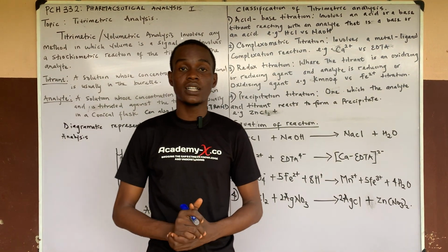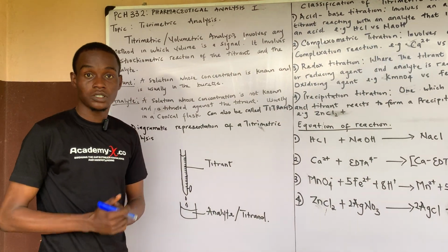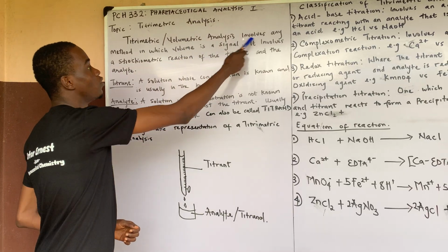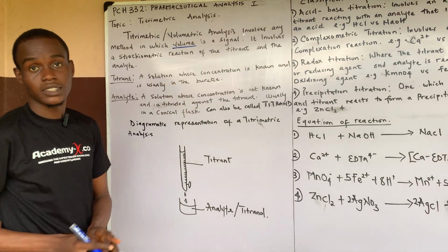Today we'll be talking about titrimetric analysis. Now, titrimetric analysis is also known as volumetric analysis. Titrimetric analysis, or volumetric analysis, involves a method in which volume is the signal. Now, volume here is a signal.